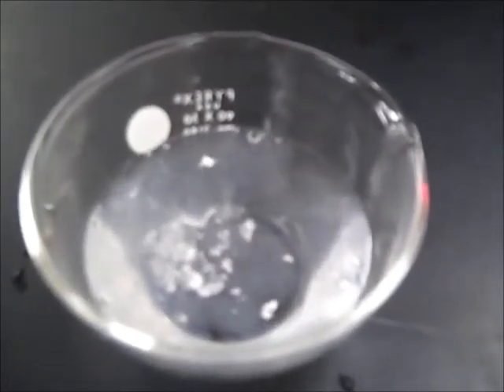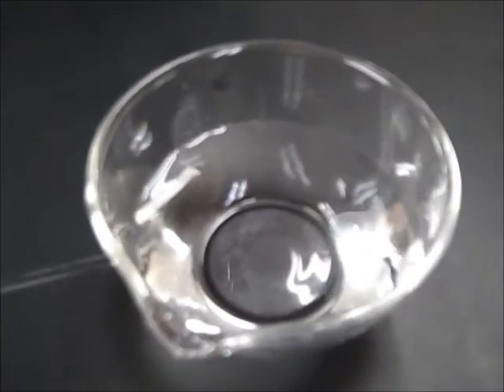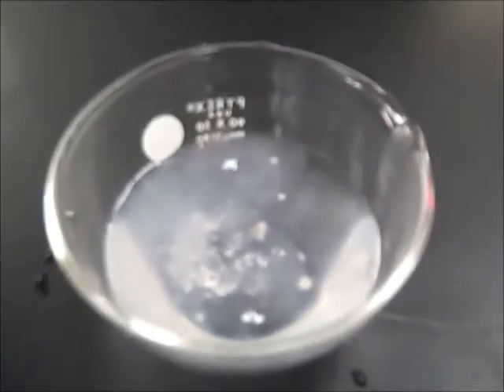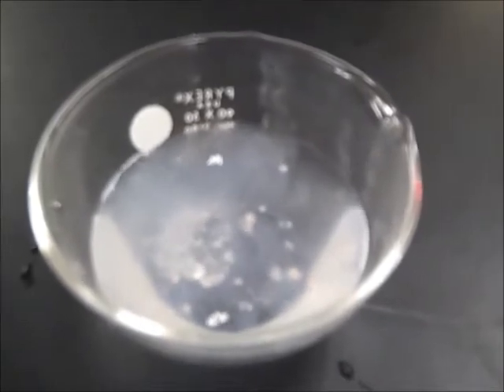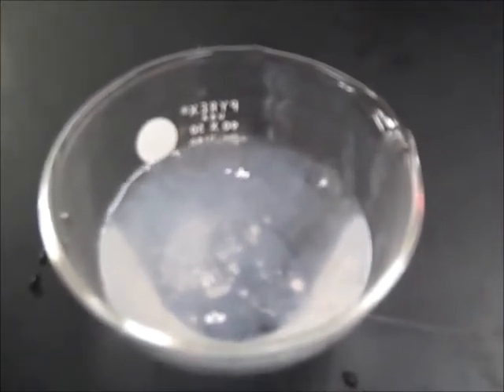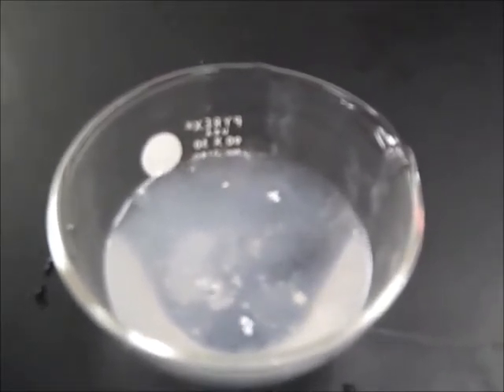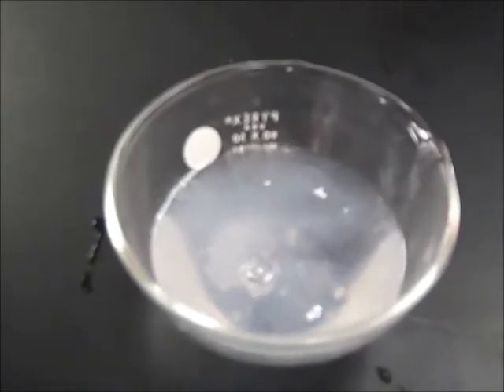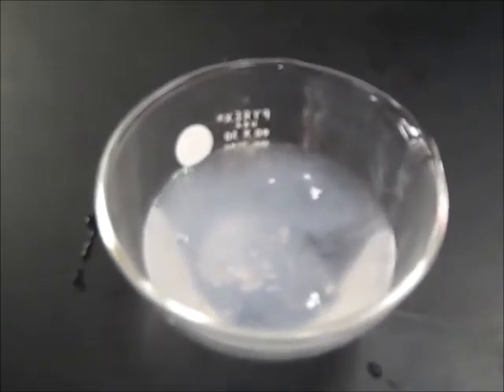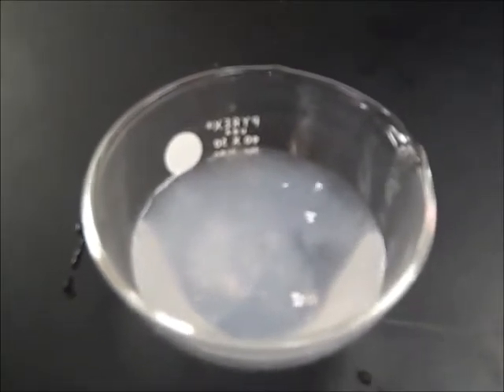And magnesium's still doing nothing. Ooh, a little fizzing action too. Okay, that's part one.